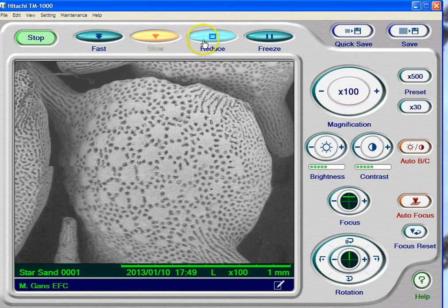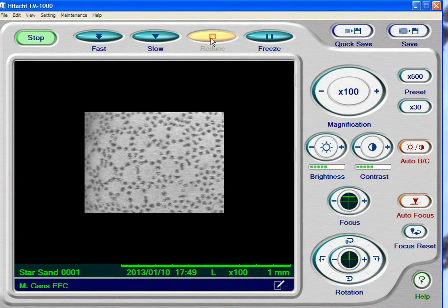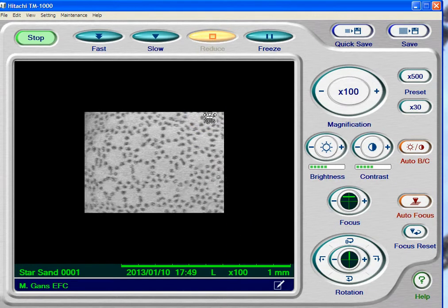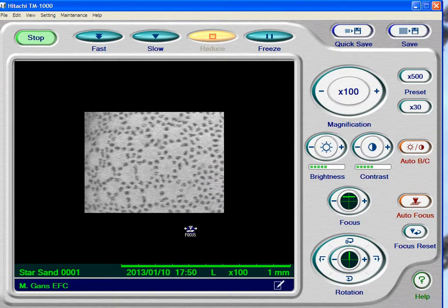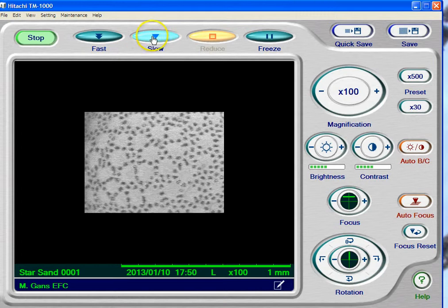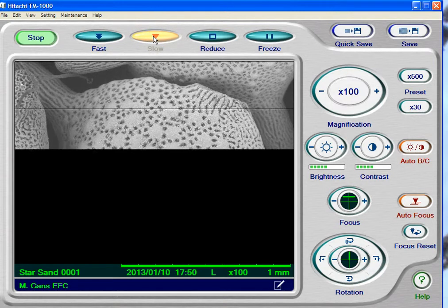So what about Reduce? Reduce is another way that a lot of people focus electron microscopes, and most people do use it. What's happening — if you look at this right here — the refresh rate is extremely fast, which means that when you make changes, they're very obvious. And you're welcome to do that; it's a perfectly legitimate way to actually do the scope. To get off of that, you simply go back to either fast or slow scan, and you're going to get the picture that you actually want.